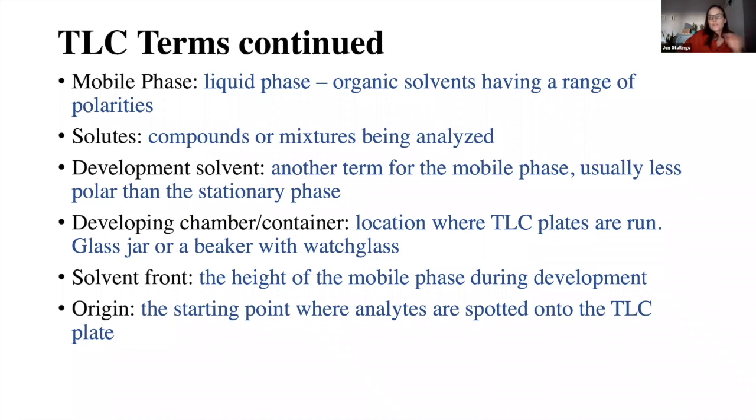Once you get to a certain height, not at the very top of the plate, but just below it, you want to remove your TLC plate from the chamber, because you never want your solvent front to go all the way up and take over the whole surface. You want to make sure that you stop it there. So our solvent front is the height at which our mobile phase, aka our development solvent, climbs up our TLC plate. And last is the origin. The origin is where you're spotting your solutes. It's pretty much the starting line.